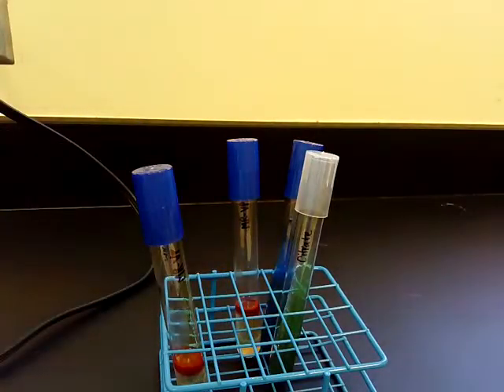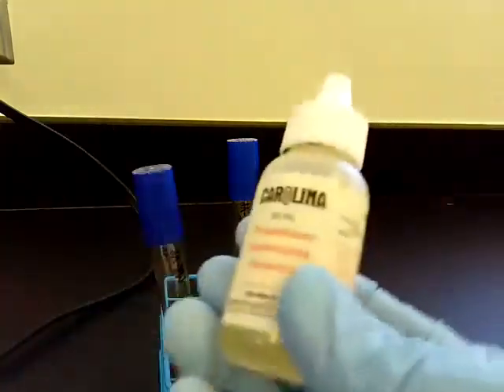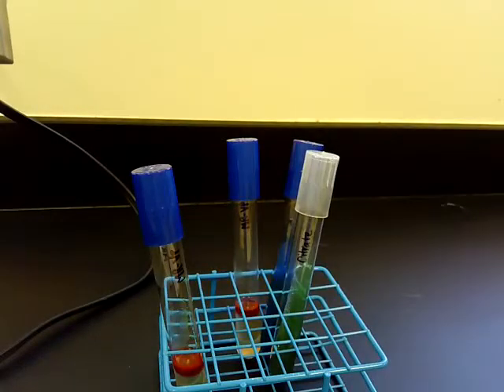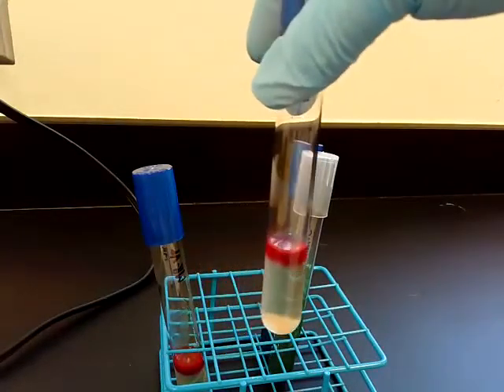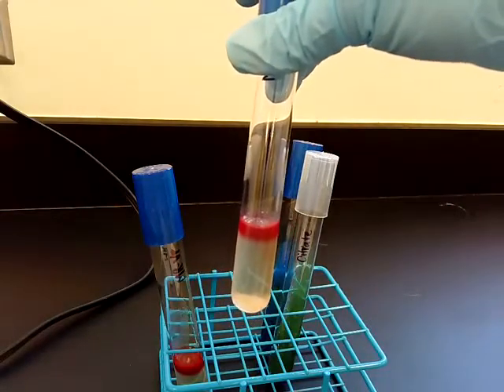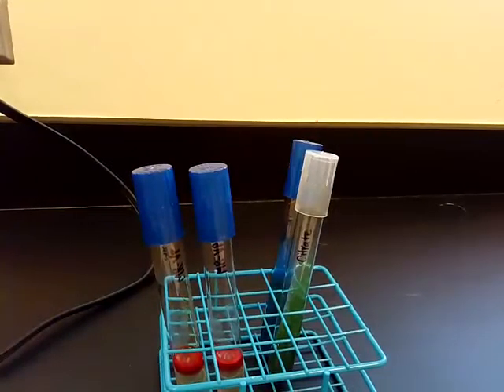Now for the VP test, you actually add two different droppers. So you're going to add alpha naphthol and potassium hydroxide. Now I added these, and then you're supposed to let them sit for 20 minutes, and after 20 minutes you can see that the color change happened. So very similar to the color change that you see in the MR tube, you can see that this is positive for VP.